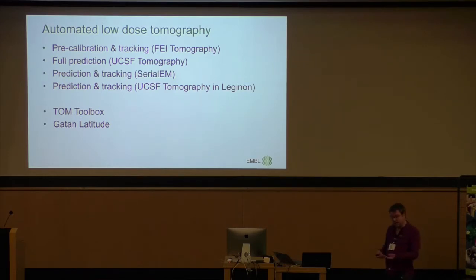So he noticed, like, okay, most of the systems I work with, the stages aren't that great, and this whole perfect rigid body rotation stuff doesn't work. And this prediction stuff, this pre-calibration stuff also doesn't work. So he came up with prediction and tracking, which is really nice.